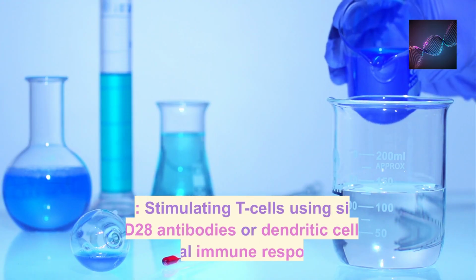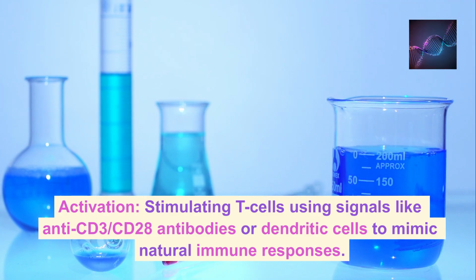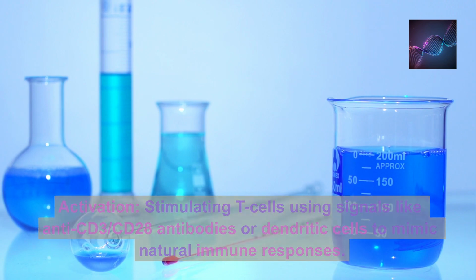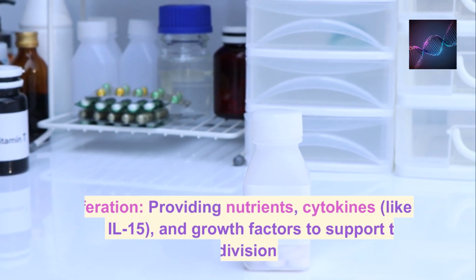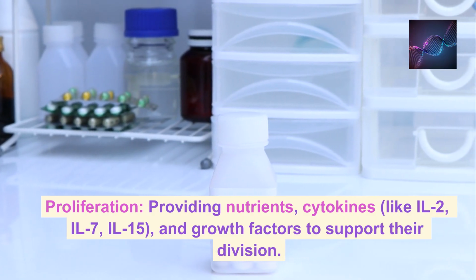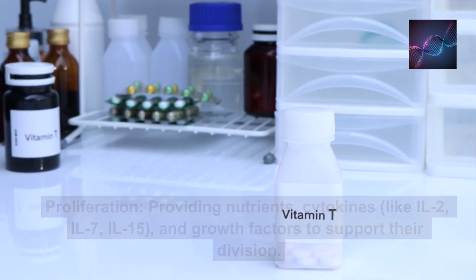Activation, stimulating T-cells using signals like anti-CD3, CD28 antibodies or dendritic cells to mimic natural immune responses. Proliferation, providing nutrients, cytokines like IL-2, IL-7, IL-15, and growth factors to support their division.